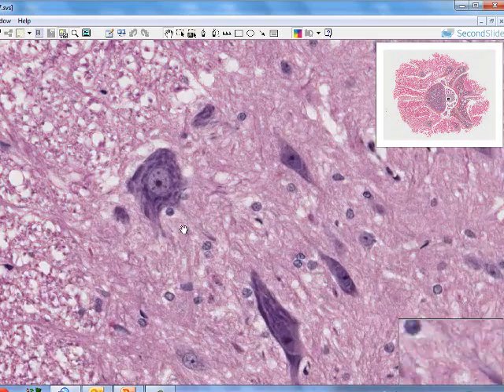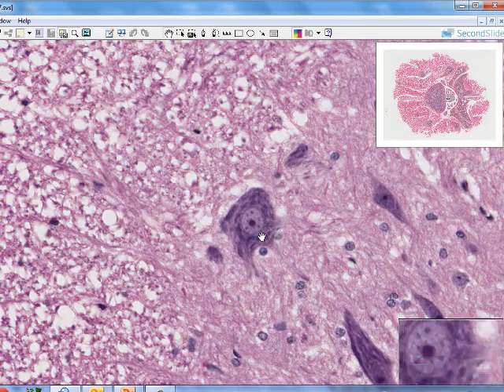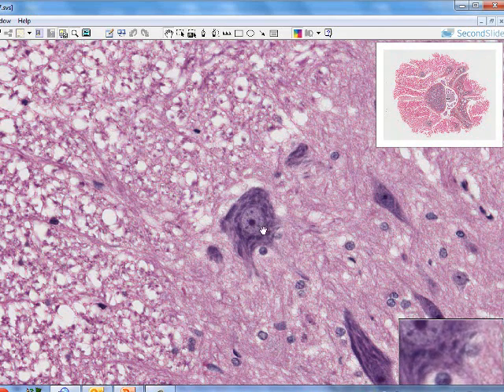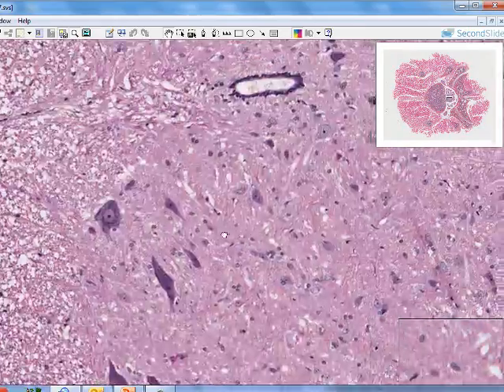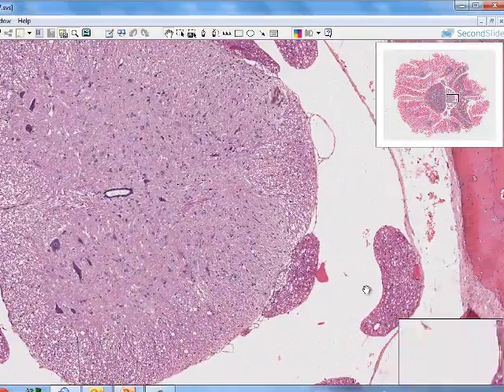There's a nice cell here. You can see the Nissl substance in here, patches of blue in through there, which is the cell body, nucleus, nucleolus, nucleus from here to here. There's nucleolus in through here as well. And we can see these nerves.